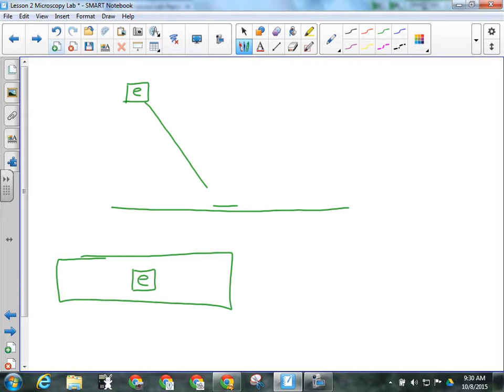That's the way it needs to go into the microscope. Right side up, so if I'm looking through the microscope, I want to see the letter E in front of my face, right side up. I put it in the microscope that way, because part of what we want to do is see what happens when the lenses are doing what we think they do. They might not just make the thing bigger, they might also alter how it appears, because of what happens with the light. There's more than one lens in there.